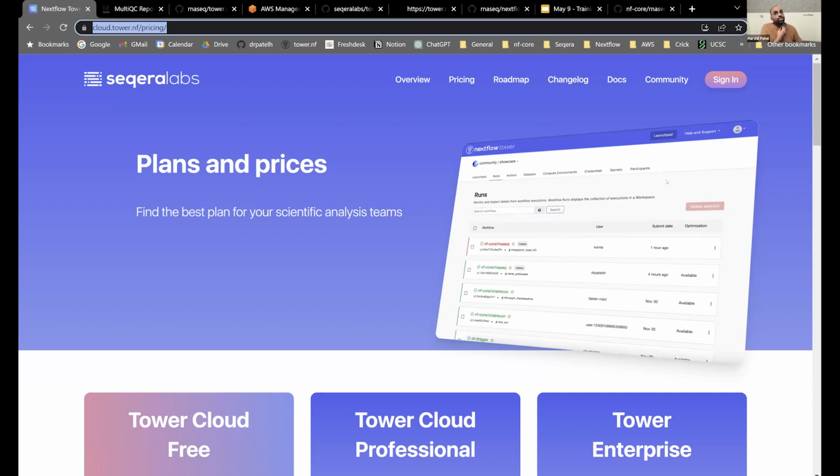It depends on your infrastructure. This is, I guess, one of the strengths of Nextflow and Tower: from conception, they've been designed to work pretty much anywhere. But that can also be a problem because we want to get Nextflow and Tower up and running on all of these diverse environments that our customers need to support. Depending on how locked down your environment is and how firewalled it is, those requirements will be completely different. For some, it will be a couple of hours installing and getting everything running. For others, it might be more of a process. So it will depend entirely on what your infrastructure looks like.